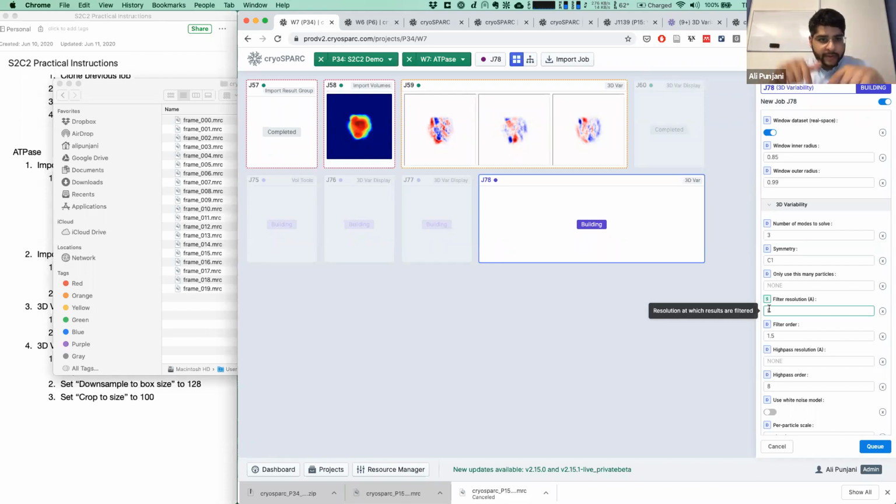the ribosome data, to separate the particles into subclasses, each one representing one more or less discrete cluster in the data. Now, within that cluster, there may still be continuous flexibility, and you should apply 3D variability again to that subcluster of data and see what kind of continuous heterogeneity you find. That's probably the best strategy in almost all cases. Try to resolve all the discrete heterogeneity you can, and then apply 3D variability to each subclass separately to get at all the flexible motion.